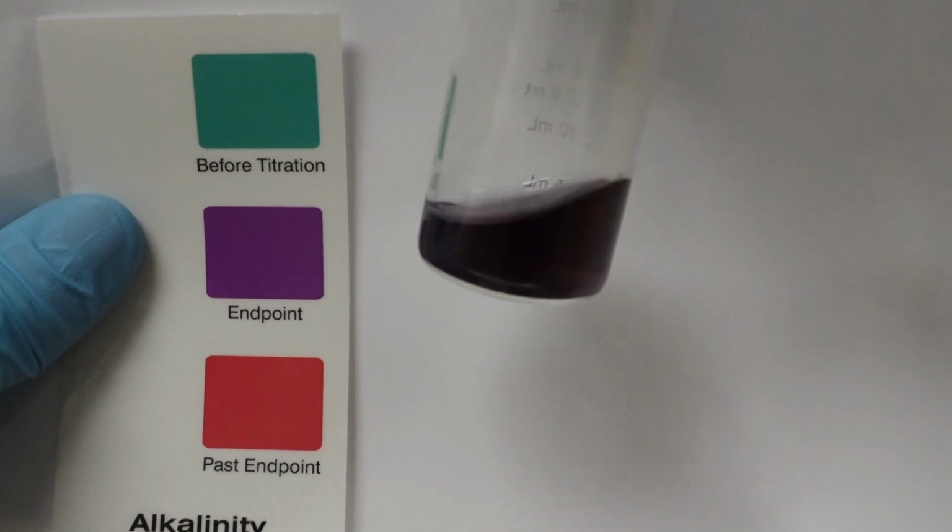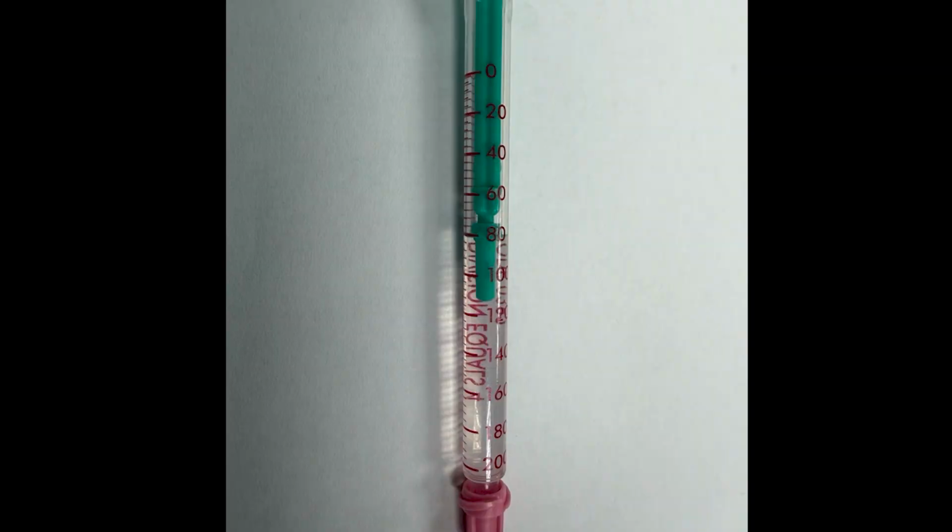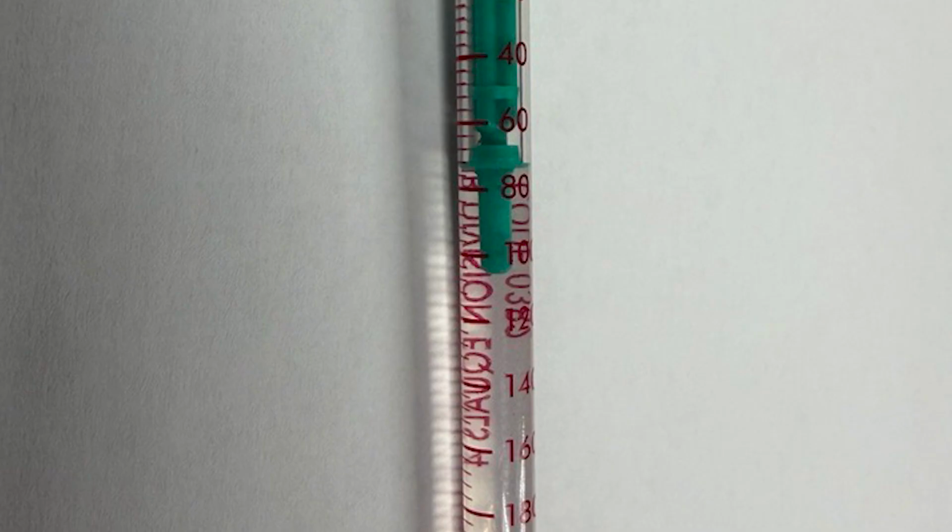Now that your titration looks purple in color, meaning your reaction is at the endpoint, you are able to determine the alkalinity reading. Read the titrator scale at the bottom of the large ring, as seen in the picture on screen now. Each line on the scale represents 4 mg per liter. If the ring is in between values, record your average of the two values.